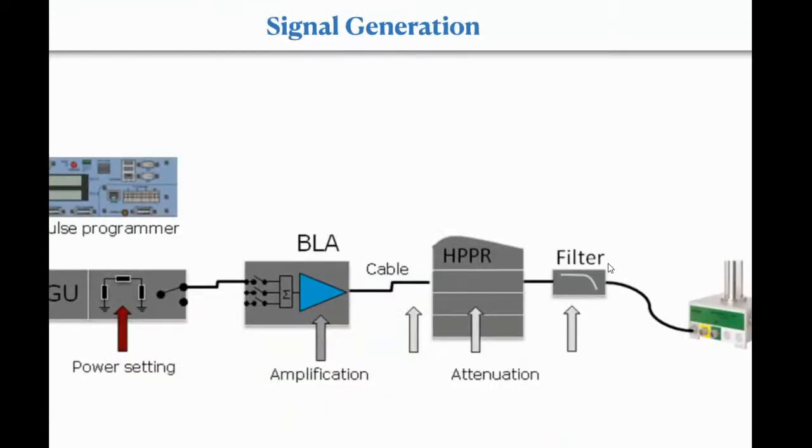Anyway, so this is the signal generation, the whole thing. This is Bruker nomenclature. You have a pulse programmer. Now, it is basically given by what is called an IPSO. It's basically a small computer that is controlling all the rest of the things, including the probe, the BCU, the preamplifier, the amplifier, everything. That is basically controlled by a small computer, CCU or IPSO, that we call. That also ends up generating the radio frequencies.